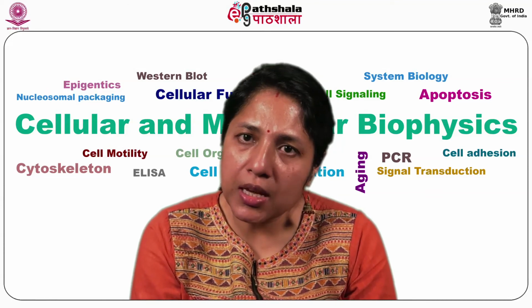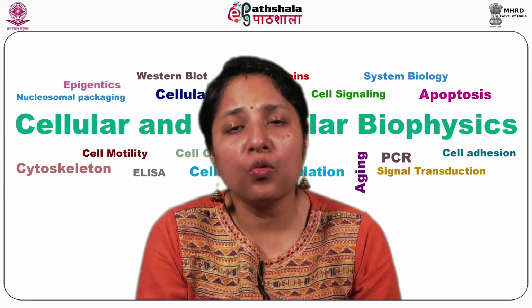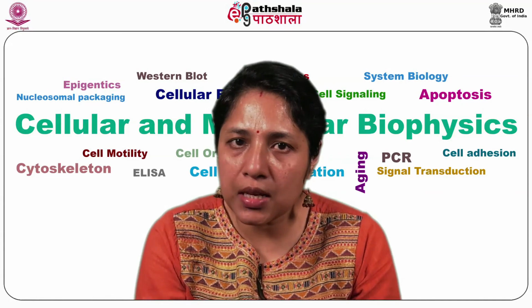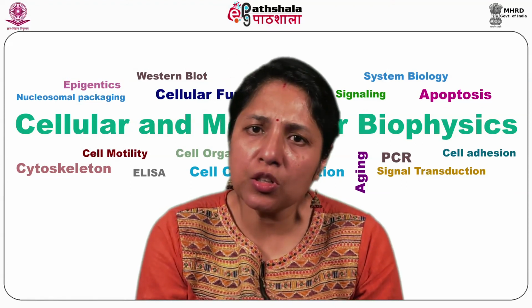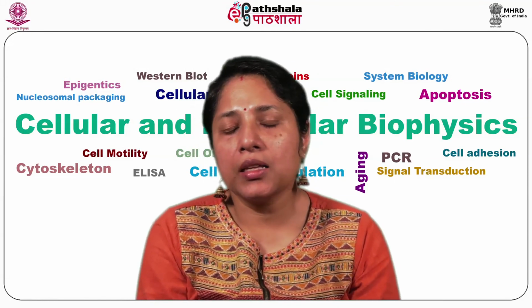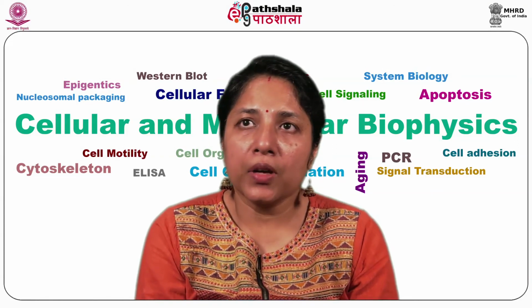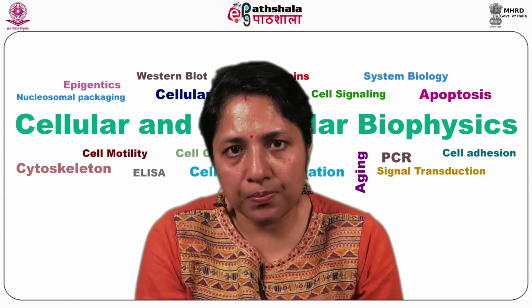For 3D motility assays, the Boyden chamber or the matrigel invasion assay is very routinely used. The other methods to study cell motility in a 3D environment are the collagen invasion assay and invasion in an organ culture. Microscopy plays a very important role in understanding cell motility, and in this chapter we have discussed various microscopic methods to understand cell motility and the various cytoskeletal structures involved in controlling it.